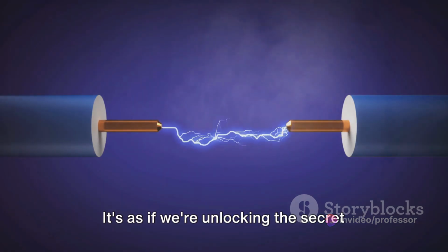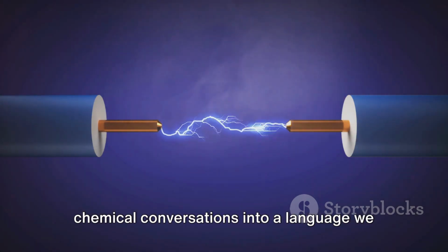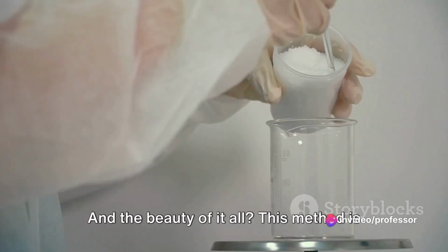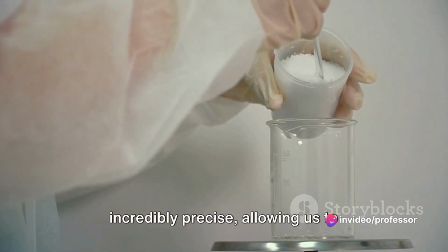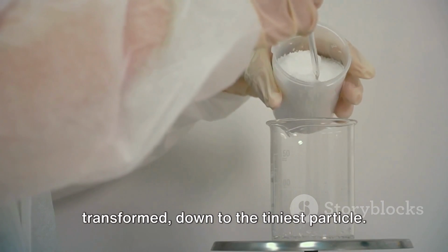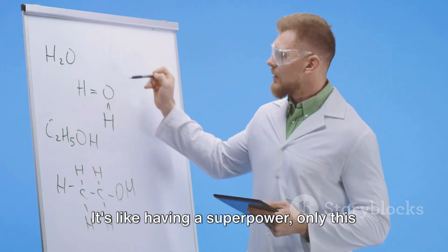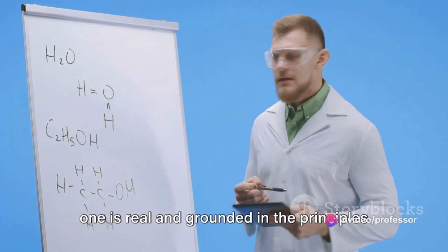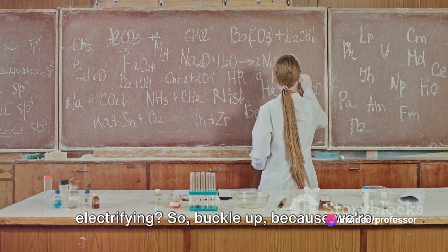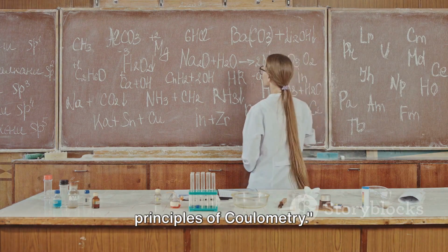It's as if we're unlocking the secret language of molecules, translating their chemical conversations into a language we understand, the language of electrons and energy. And the beauty of it all? This method is incredibly precise, allowing us to determine the exact amount of substance transformed down to the tiniest particle. It's like having a superpower, only this one is real and grounded in the principles of chemistry. Imagine that. Now, isn't that electrifying? So buckle up, because we're about to delve deeper into the theory and principles of coulometry.